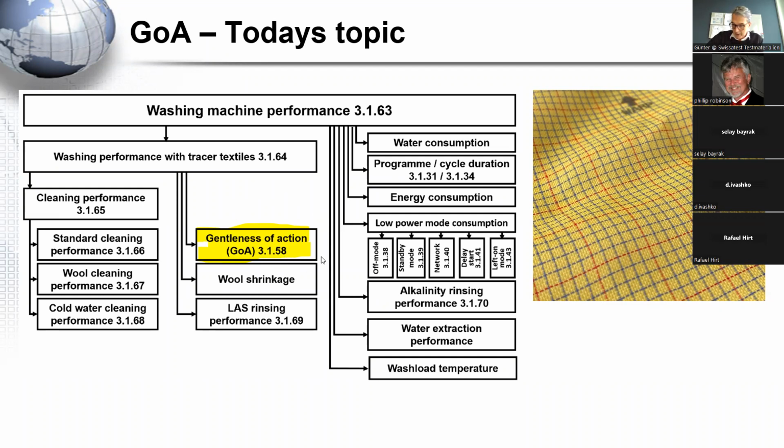And for this presentation, we have also prepared some short video sequences for a visual understanding of the whole process of the Gentleness of Action. Sometimes in between the slides, I will show you some video sequences to show you in practice how the specimen is prepared and how the testing of the Gentleness of Action is done.